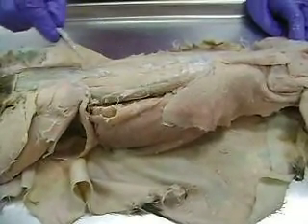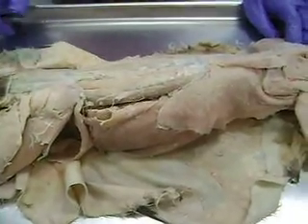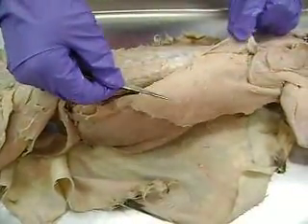These would be the erector spinae muscles. You don't have to know the individual ones — just call them as a group the erector spinae. And then from this view, this is latissimus dorsi, like we saw before.